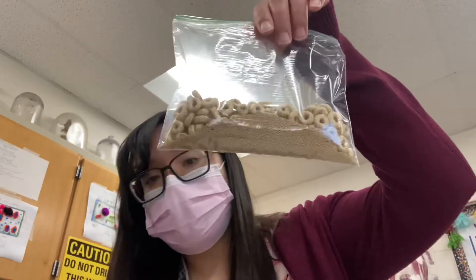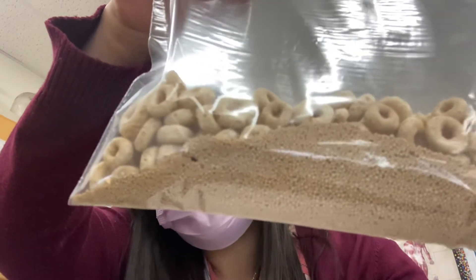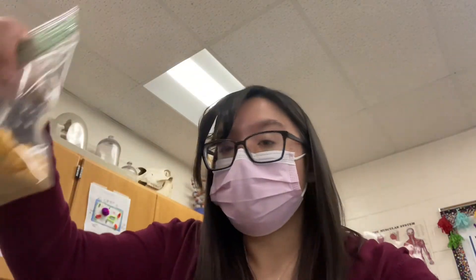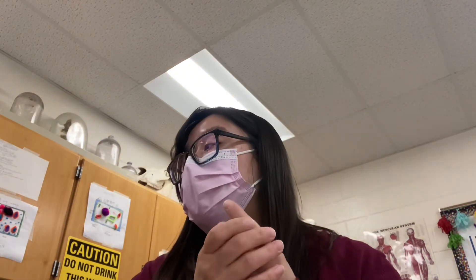I have some bags of cereal, and if you look closely you'll see there's also yeast in the bag — so we have yeast and cereal in three different bags. The different types of cereal are Cheerios, Fruit Loops, and Captain Crunch. We're going to see if we can make fermentation happen and observe some evidence of it.